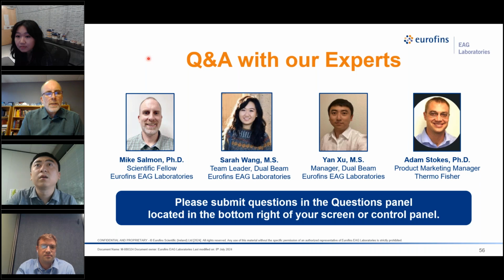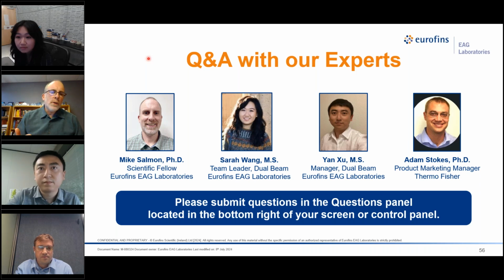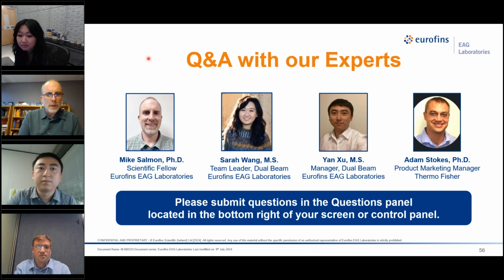Yeah, so in both cases, I guess the majority of broad ion beam polishers use argon, I think. I don't have a ton of experience with it personally, but ultimately the idea is that you do get the benefits of no gallium. You can do large areas, maybe even larger than the PFIB, but you don't have that endpoint detection ability. You can't monitor while you're milling, so you can't really stop at that buried feature that you're trying to hit. So in some cases, if you're looking at blanket films and things like that that you're not really trying to do FA on, it could be very useful and maybe is the right way forward. But the versatility of the PFIB gives you all this other access to 3D reconstruction, endpointing, and things like that that you can't do with broad ion beam milling.